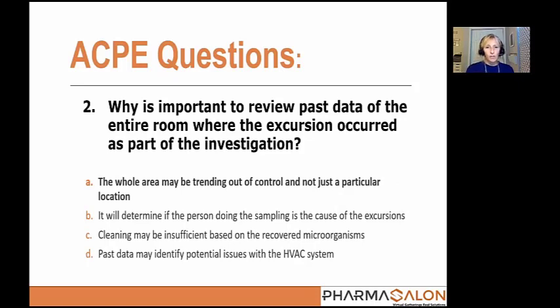And based on what we talked about here, the whole area may be trending out of control and not just a particular location. So it's important to take a look back at all of the data that you have, especially if you can, when you're doing your resampling, not just collect the location that had not passed, but looking at some of the other areas as well.